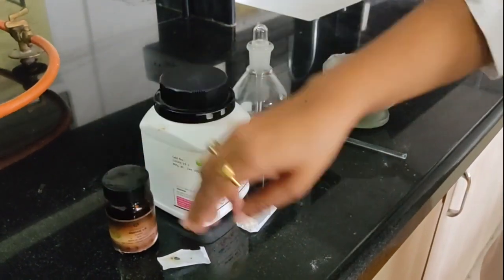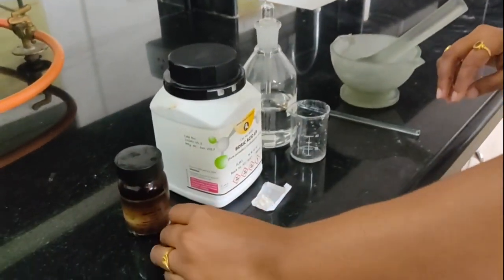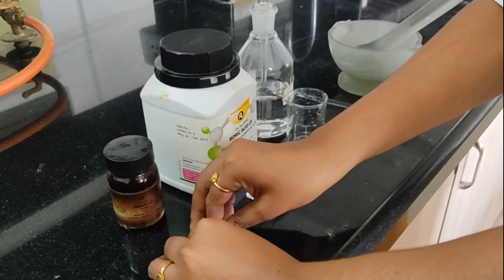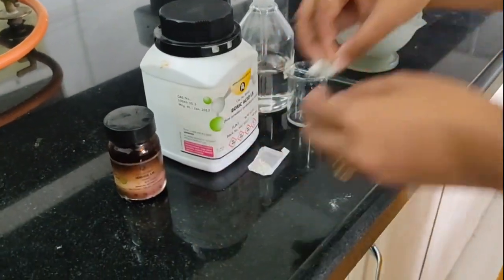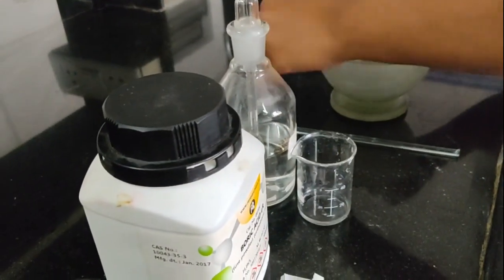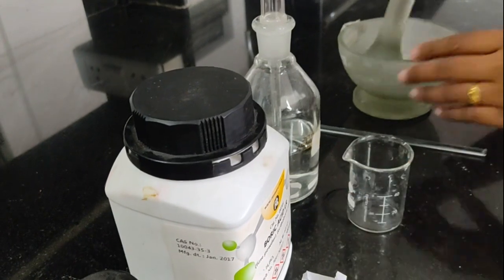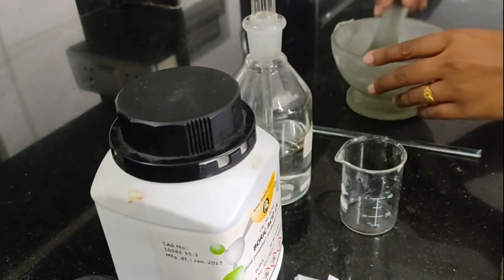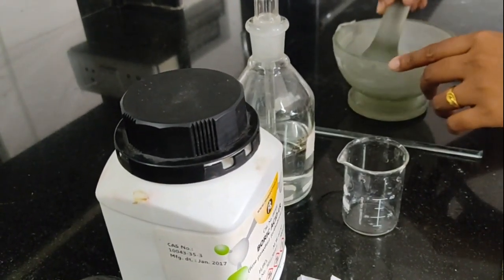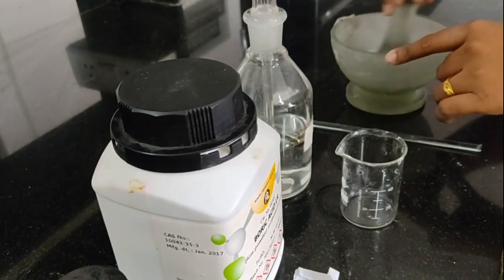So we have iodine, boric acid, and alcohol. First of all, I am going to take these iodine crystals into this glass mortar, and after that I am going to add this alcohol into it, and then properly mix and solubilize this iodine in the alcohol.